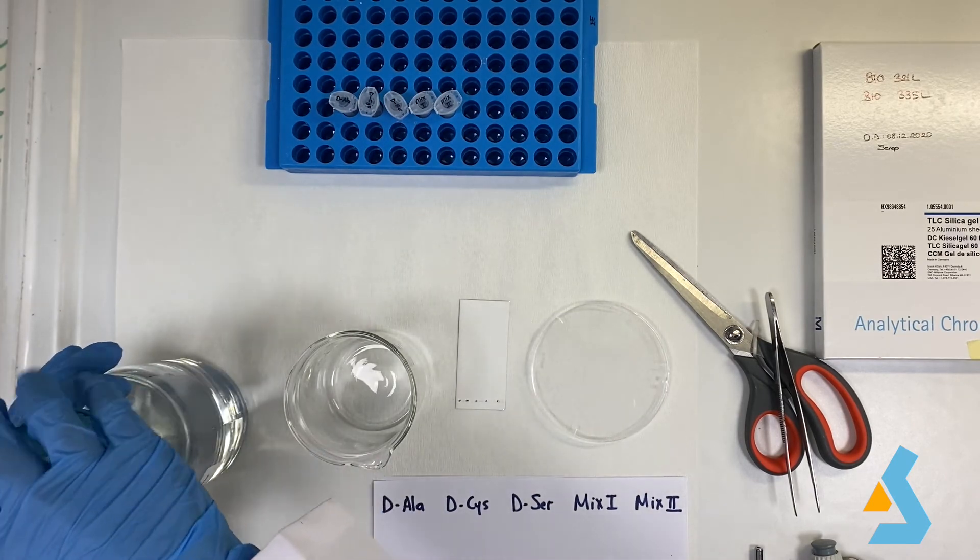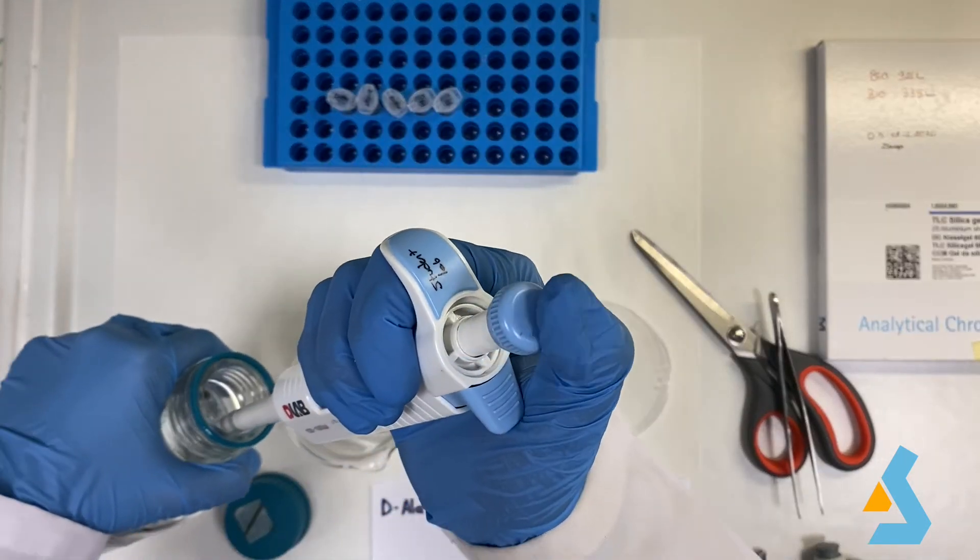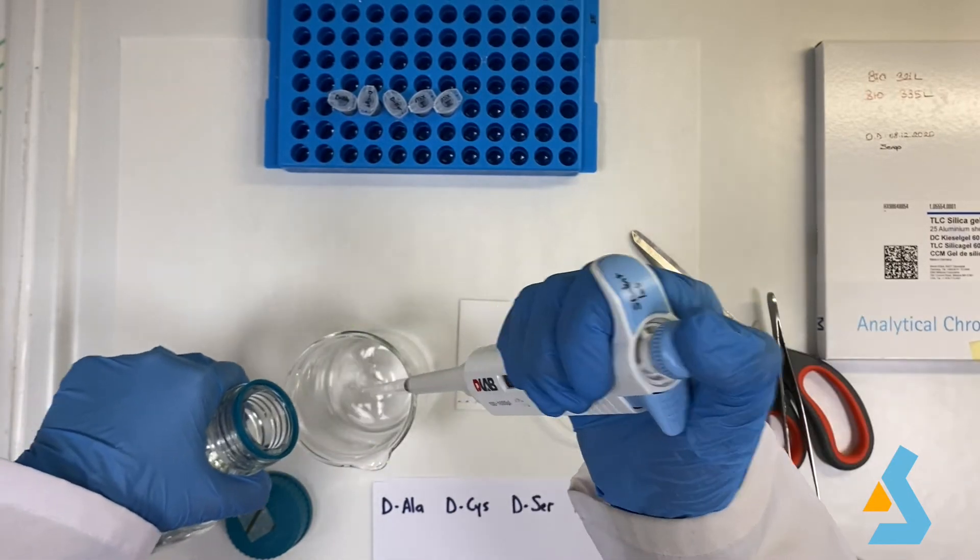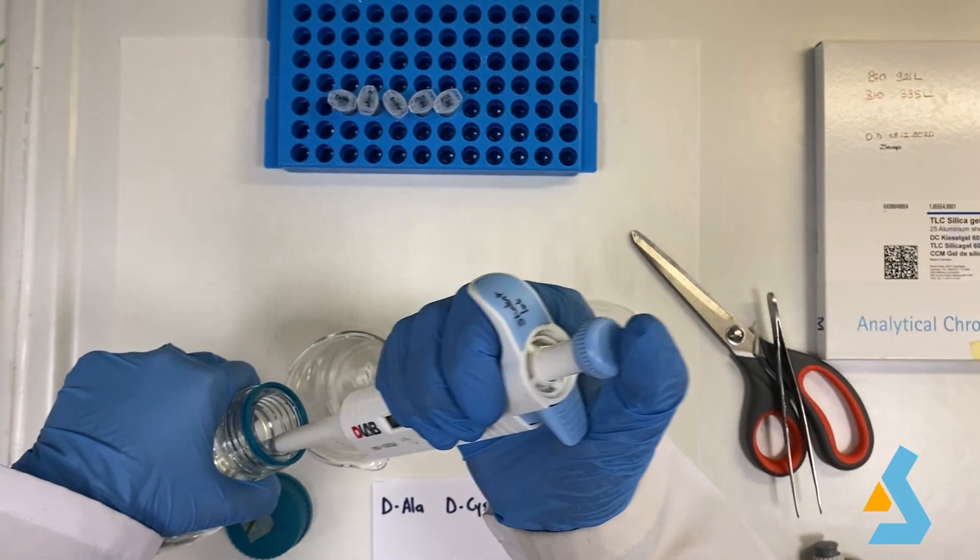We now add the solvent to the TLC chamber. The level of the solvent should be below the sample levels. Otherwise, sample may dissolve in the solvent.